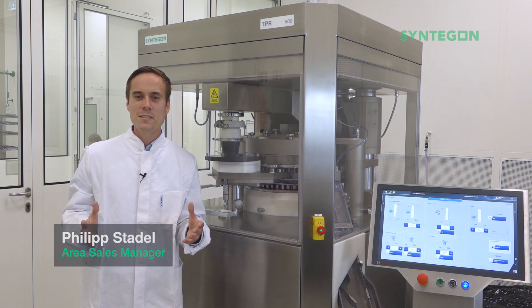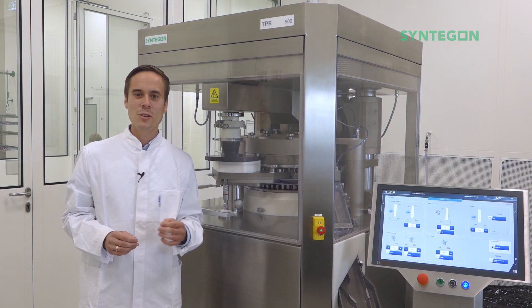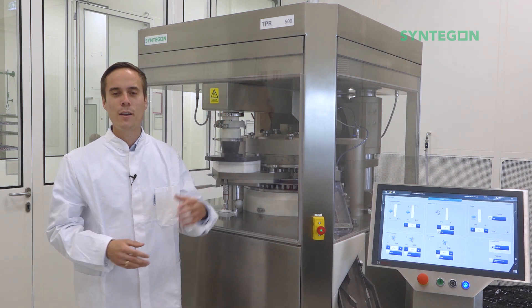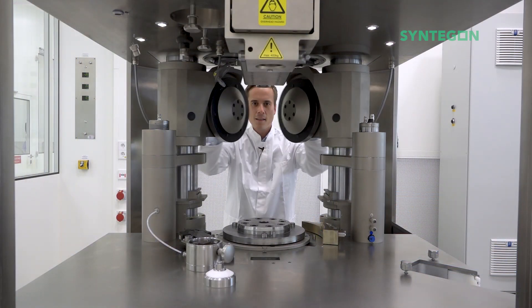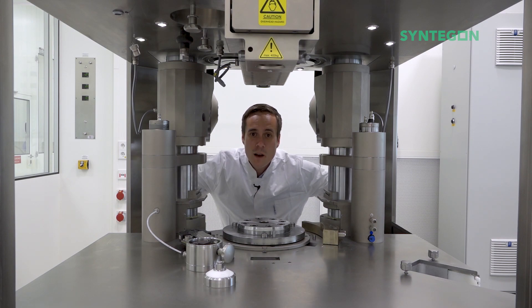Welcome to our brand new series OSD Tech Bytes. Today we are live in our Syntagon customer center here in Weiblingen. We're standing in front of our TPR 500 tablet press in one of our clean rooms. In this episode of our OSD Tech Bytes we would like to talk to you about the features of the TPR 500 when it comes to cleaning.